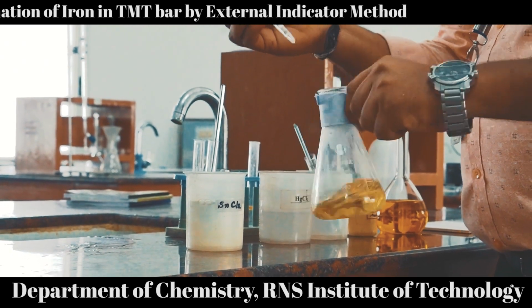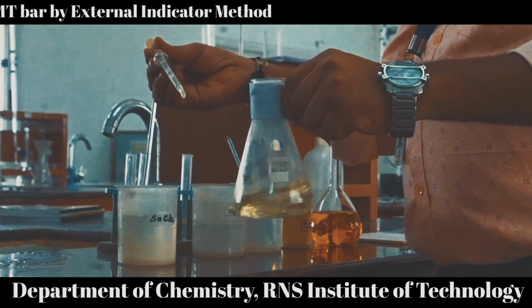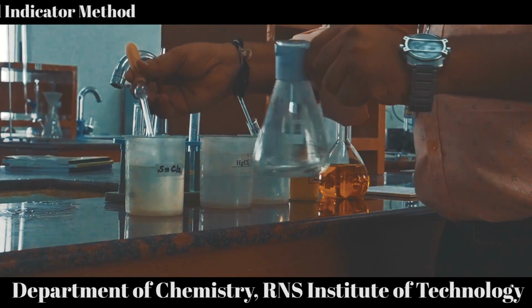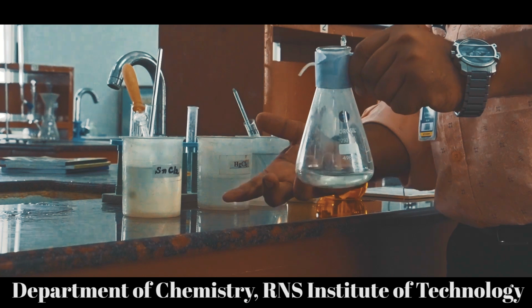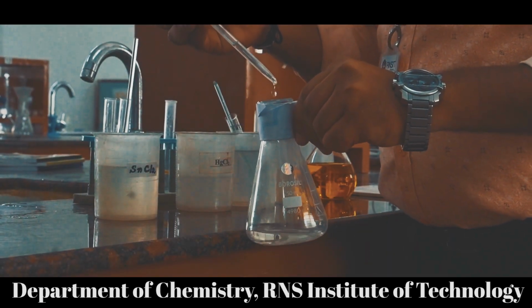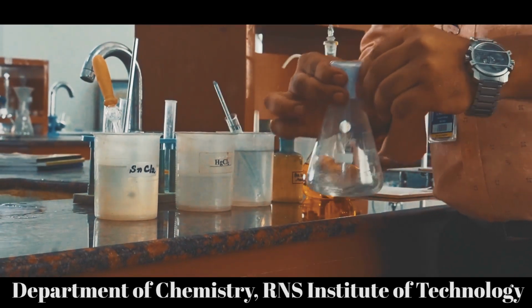Okay. So stannous chloride is a reducing agent. When you add this, it will reduce ferric chloride to ferrous chloride. That is, Fe3+ ions are reduced to Fe2+, so that's why the solution color will become colorless. So you have to add 2 more drops in order to ensure complete reduction. So 1 and 2 drops. Okay, so it will ensure complete reduction of the solution.